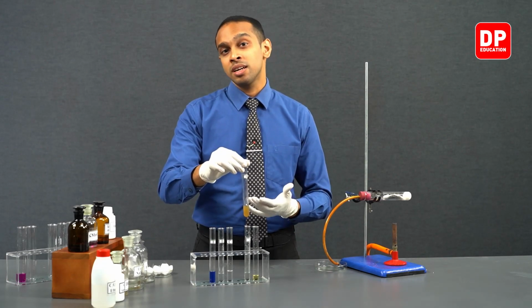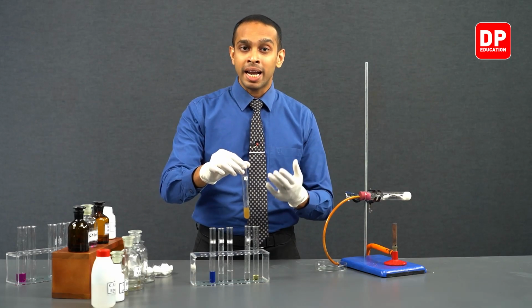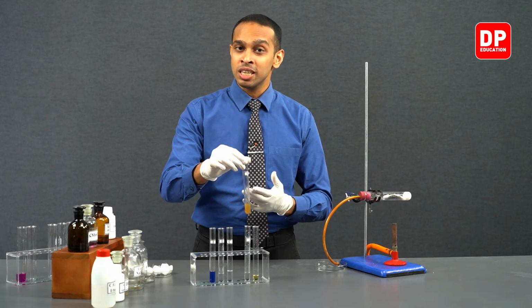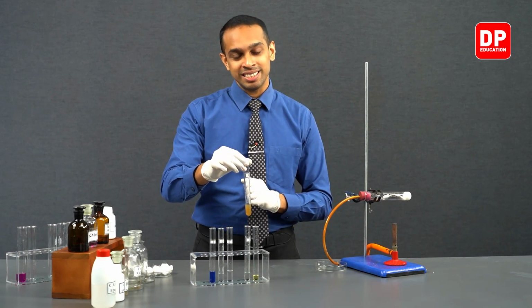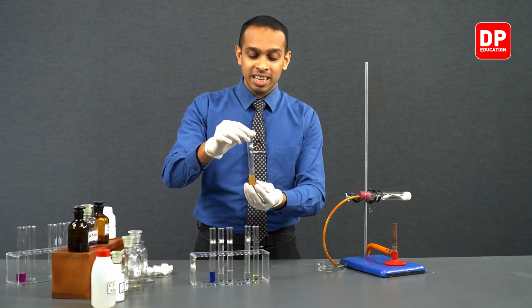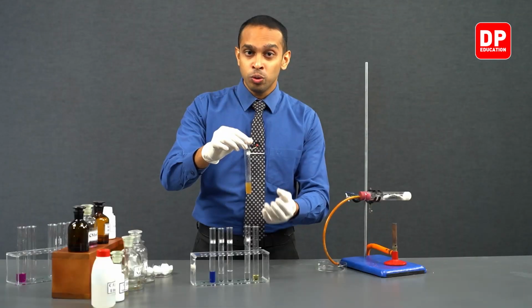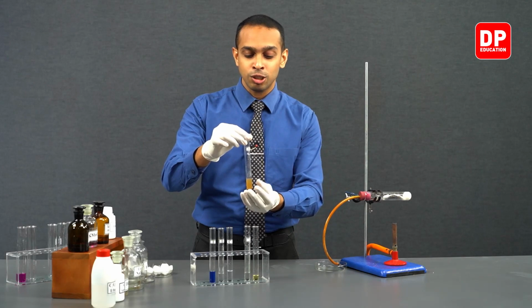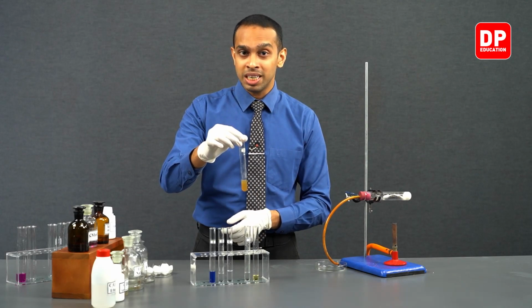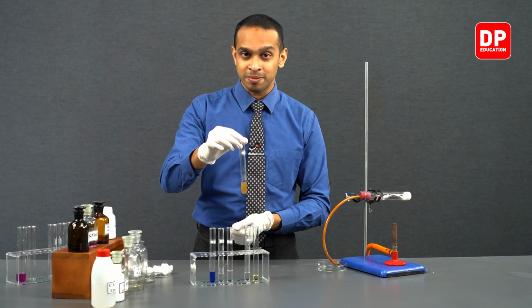Afterwards, these manganate ions further got reduced to form manganese dioxide, which is a water insoluble brown precipitate. And what you can see over here is the suspension of MnO2 brown precipitate. The fine particles of manganese dioxide are spread throughout this aqueous medium, producing this brown suspension.